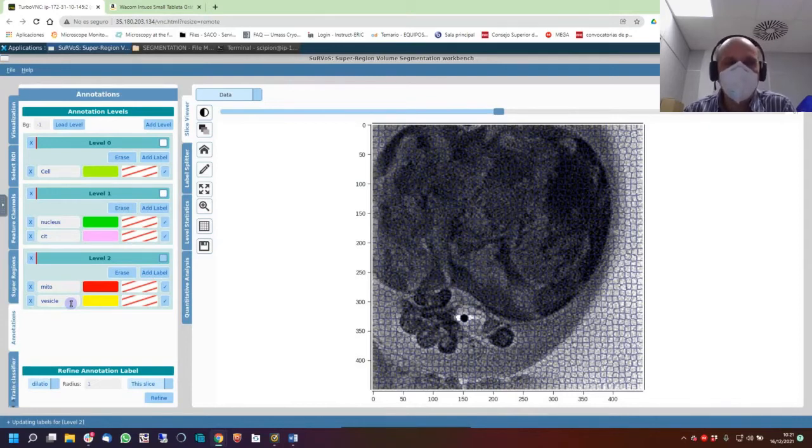This name will be saved into the HDF file. So you can go for naming, for example calling the labels mito, and then measure volumes, and then extract data from that. Another question: these levels will be used to create a mask. In the mask file, the values associated to the mitochondria, vesicles, or whatever, are they fixed, or can you fix them somehow? For instance, vesicle with value 5 and mitochondria value 4?